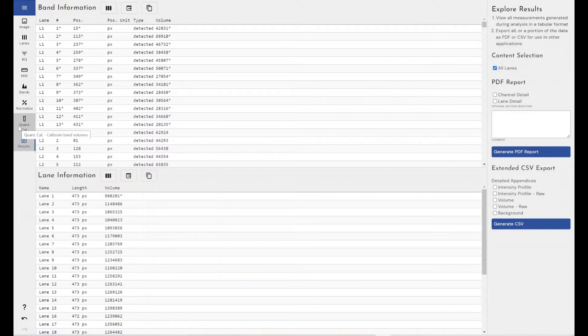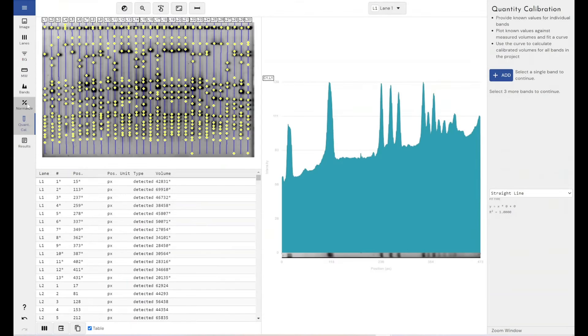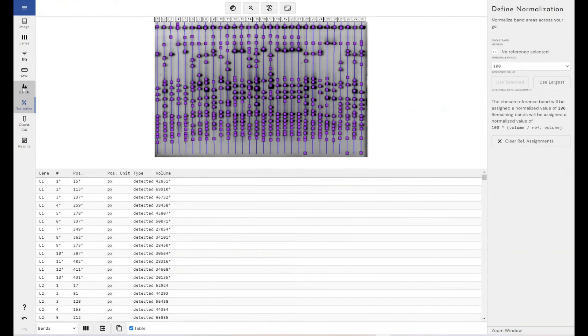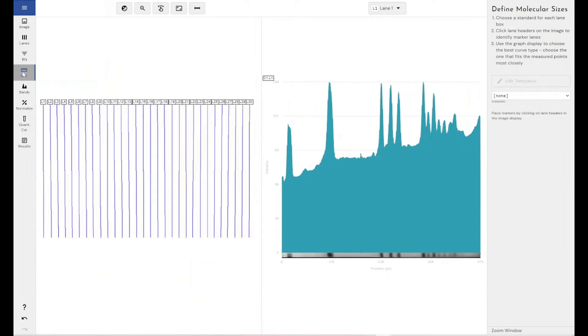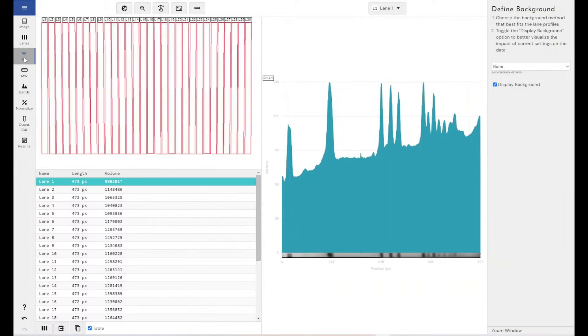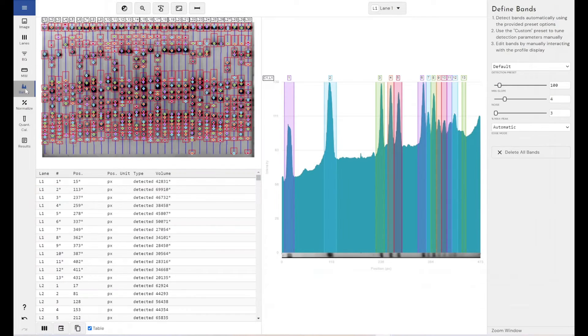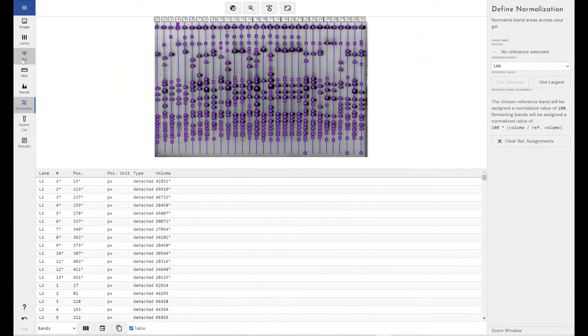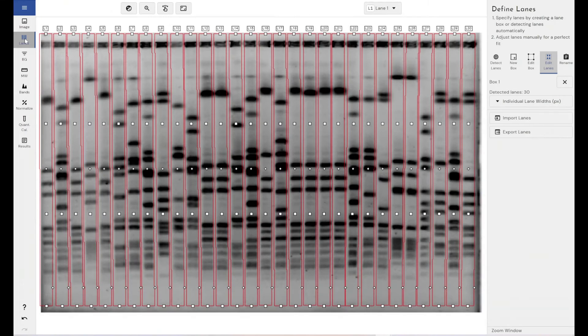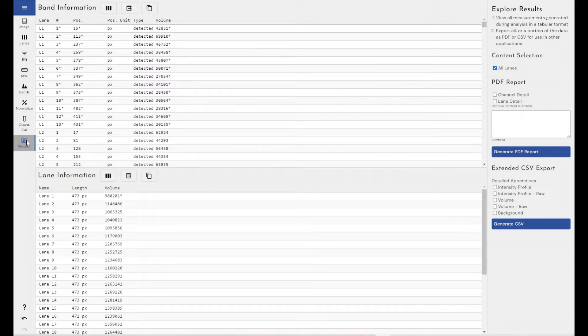And if you wanted to double check that the settings that you were expecting to be applied within your protocol have been applied, you can go back through all of the workflow modes and view what settings have been used. So you can see what your background removal method was, what your band detection settings were, your normalization settings, your lane numbers, things like that. So that's how quickly we can make your analysis by using our automated features.